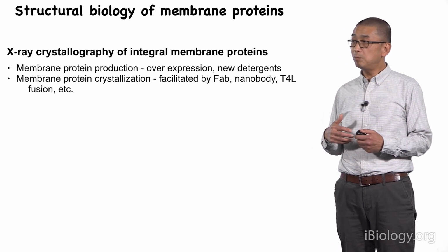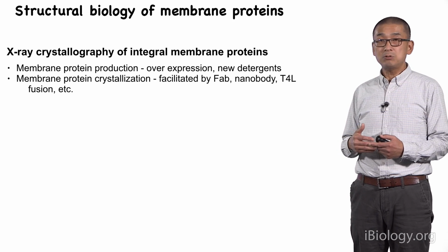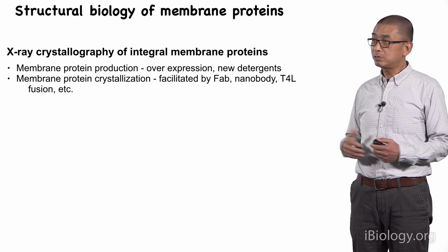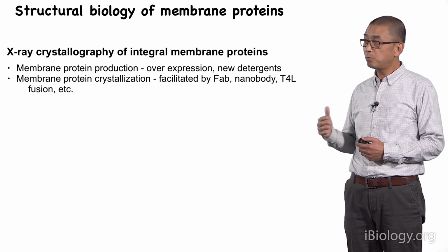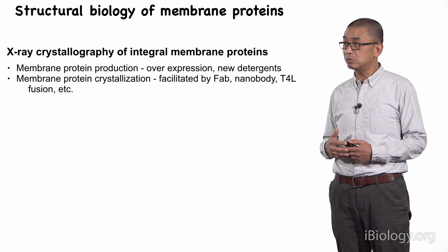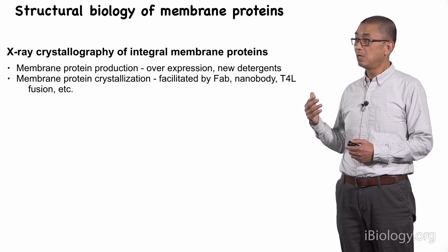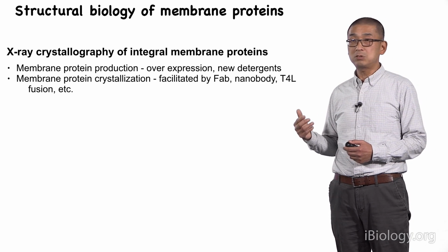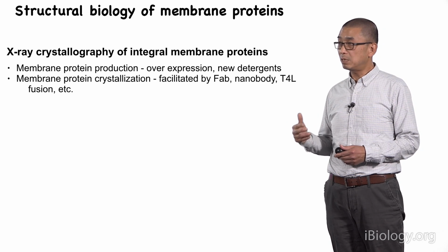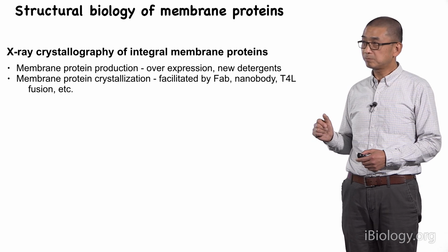Now, structural biology of membrane proteins is a particularly challenging area. Over the last 10, 15 years, tremendous progress has been made by X-ray crystallography in studying integral membrane proteins. Particularly, progress was made in membrane protein production using overexpression systems, and in developing new detergents and new methods for crystallizing membrane proteins.